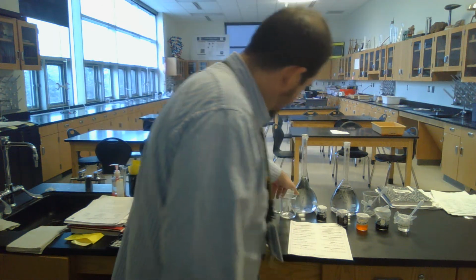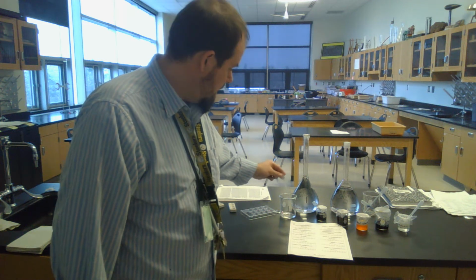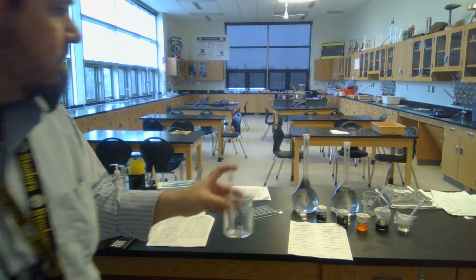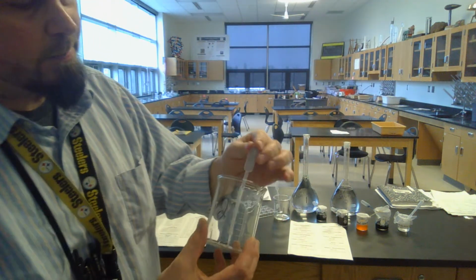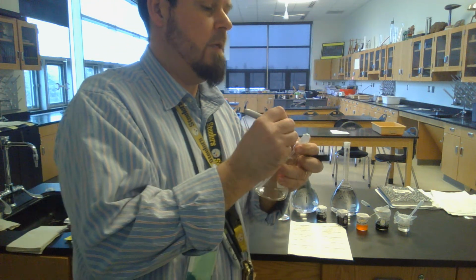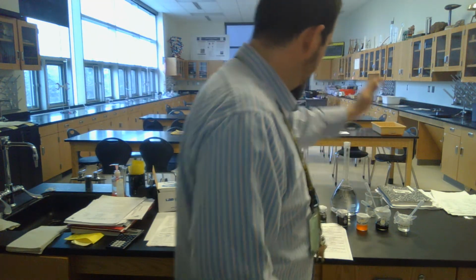So notice indicator solution 1's got a 1, the beaker's got a 1, the pipette has a 1. I'm not sure how well you can see that, but they all do have 1s on them. And the 2s all have 2s on them. So we're going to keep them separated. Oh, wait, nope, put a 2 on the pipette. Come on, buddy. Get your act together. Okay, now there's a 2 on the pipette. We good now. Okay, we're going to keep them separated.